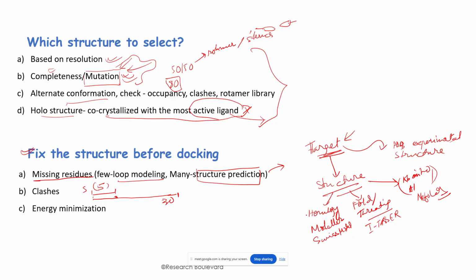So I will show you homology modeling by implementing this software called Modeler and also SWISS-MODEL, and also let's see how AlphaFold prediction does as compared to these two homology based modeling methods. Okay, so let's compare the results and see.